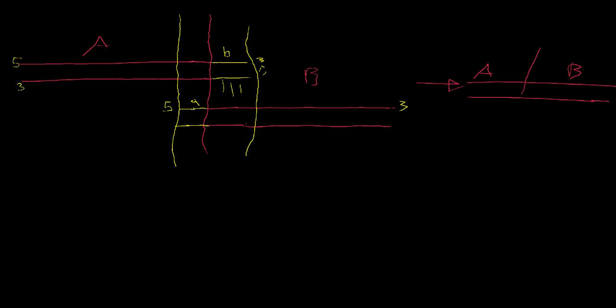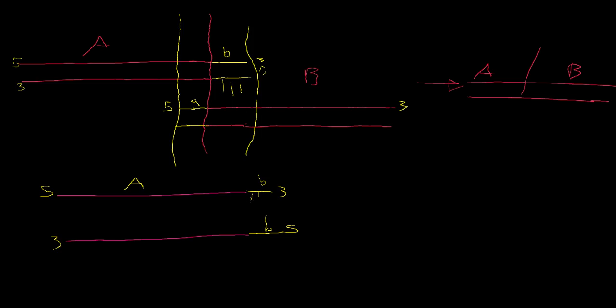So let's see here. I'll try to redraw everything all denatured. So we have our fragment A, with its overlap with B. Here's a little lowercase b. Here's a 3', 5', and here's A. Sorry about the colors. Hopefully you can keep track of them. And 3' and 5'. And I'm just going to draw a few base pairs there. So now we have one of our fragments has annealed, and you can imagine that the same thing, that B has also annealed. And they're just kind of floating around. I'm not going to draw B quite yet, but you'll see why.